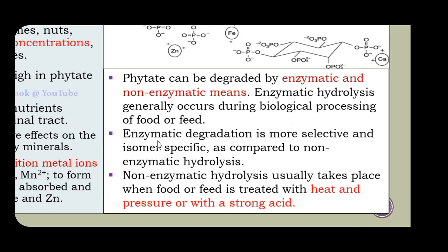Further, this enzymatic degradation is more selective and isomer specific. Very specific to the isomer, in the sense that a particular enzyme acts on a particular isomer of the component to get it degraded. So it is very selective in its nature.